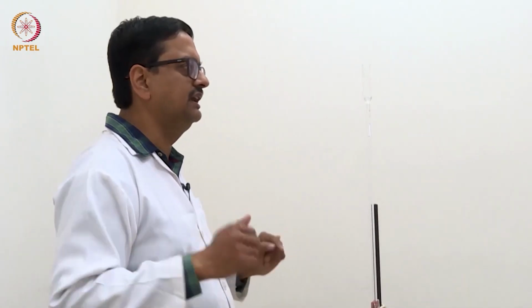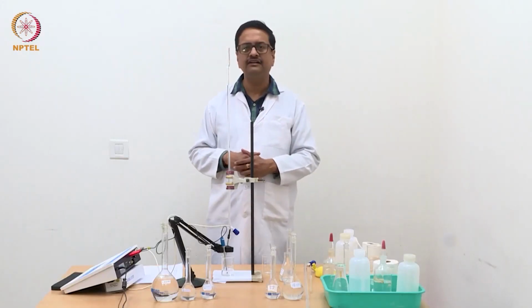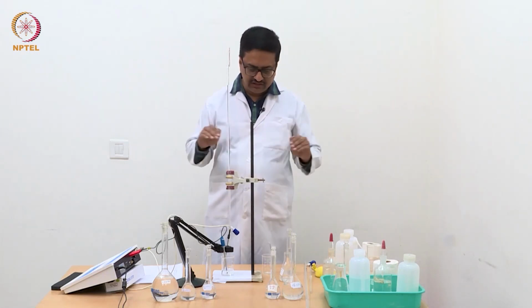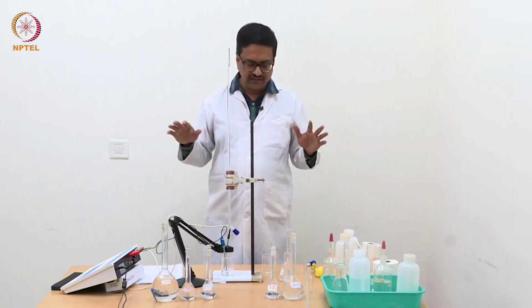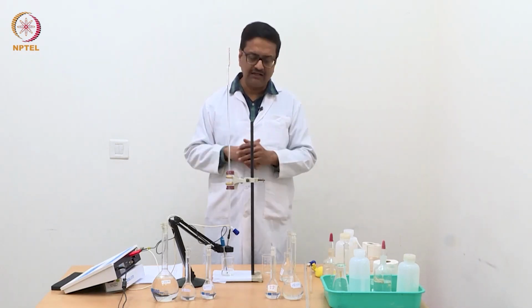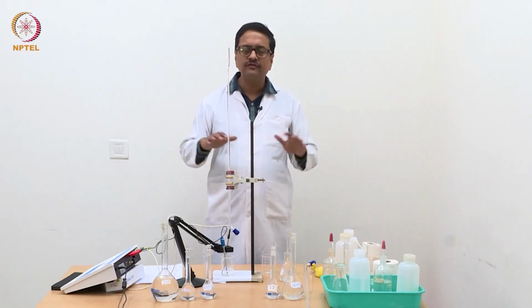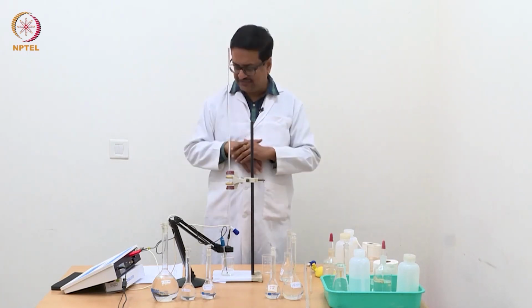In this titration, chloride ions will be continuously removed and replaced by nitrate ions, which have about the same conductivities. Therefore, during the titration of chloride with silver nitrate, as long as there is chloride left, there will not be much change in conductance. It will remain almost the same.